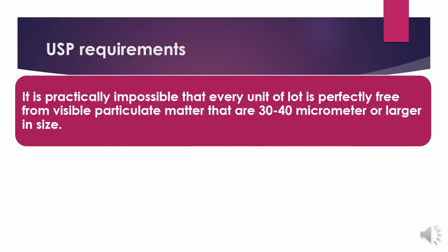It is practically impossible that every unit of a lot is perfectly free from visible particulate matter that is 30 to 40 micrometer or larger in size.